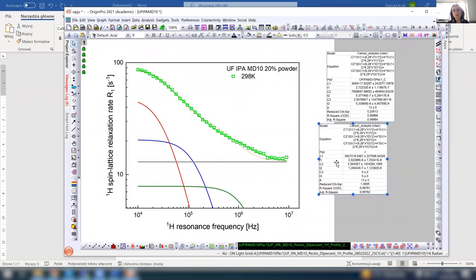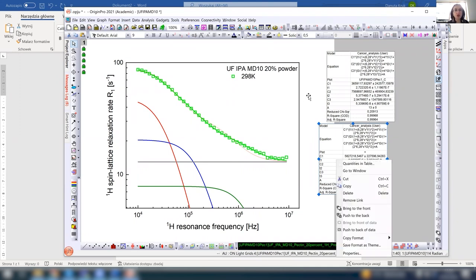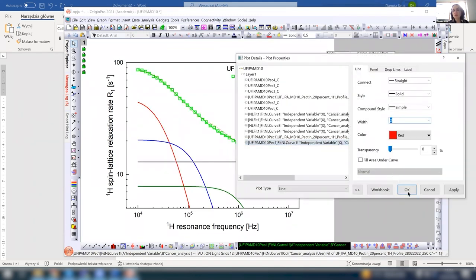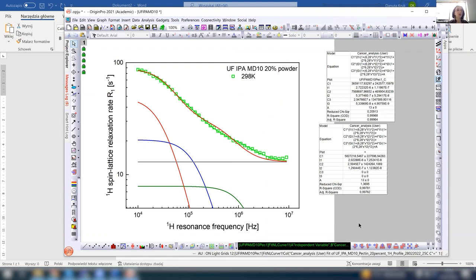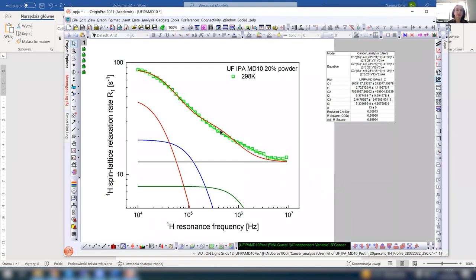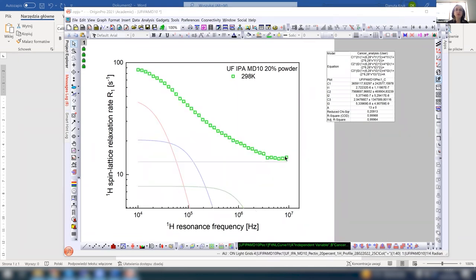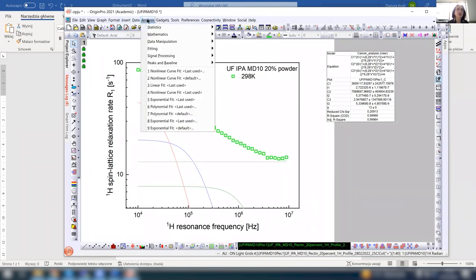Well, it did not work well, because you see still we have this curve here. So the fit is not very good. However, it is largely probably because I fixed just this value here. So we can try again. This is something that happens. Although in principle this contribution is not so small, it matters.